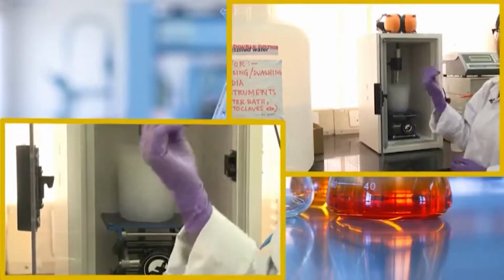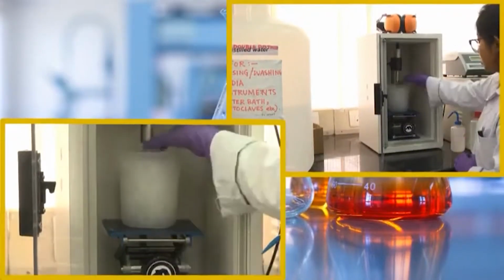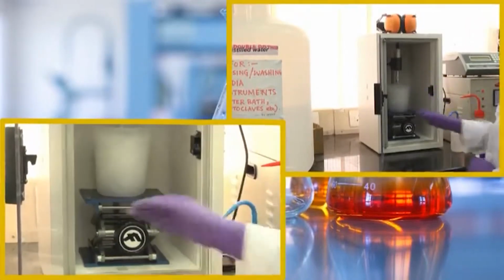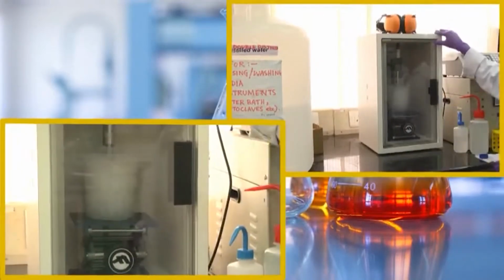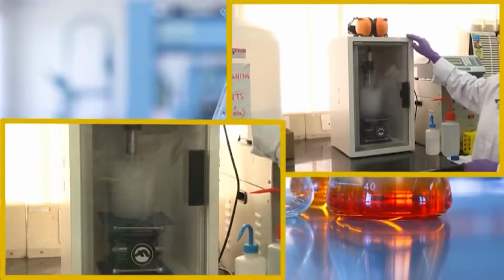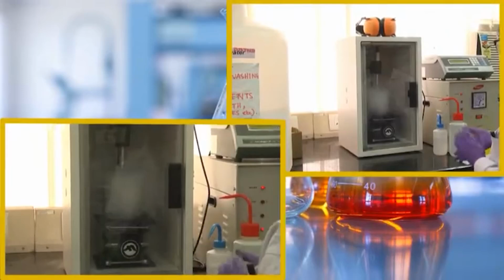The tip of the probe must be inside the solution. Now, this setup is complete. We will close the door. Always close the door while using this sonicator machine because, as I mentioned earlier, this door is soundproof. So, it will not irritate your ears or other people's.